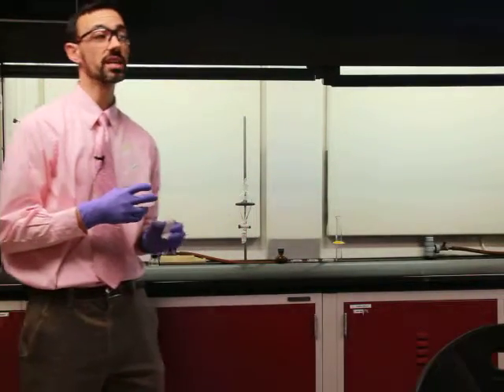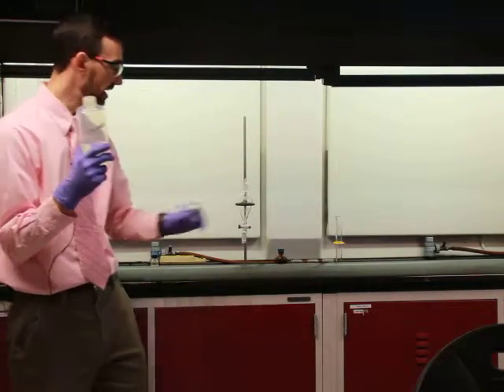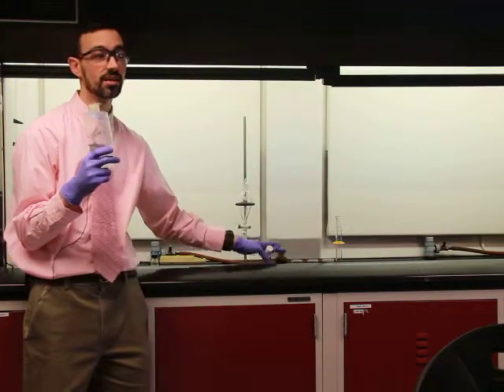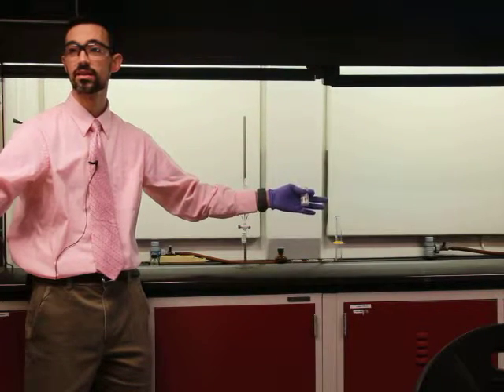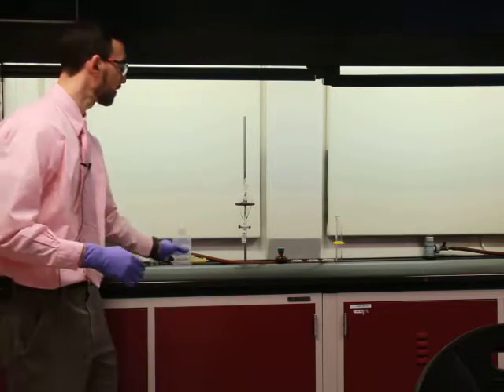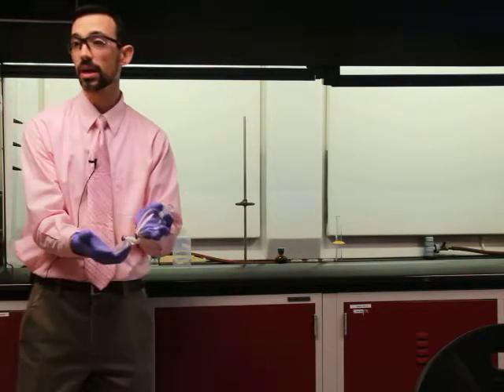The neutral compound, on the other hand, hates this stuff, doesn't like it. So where is it going to stay? It's going to stay in the ether. And we have pulled apart the 2 compounds from one another that way. And the benefit of the separatory funnel is that it has, like your burettes do, a stopcock at the bottom.